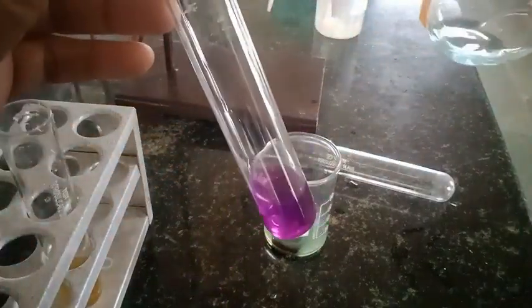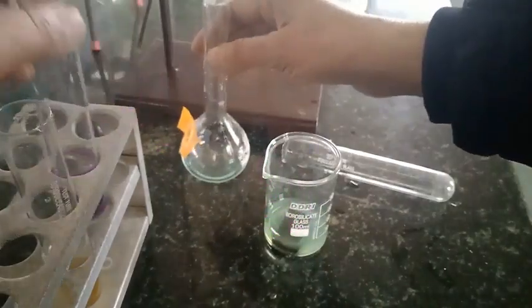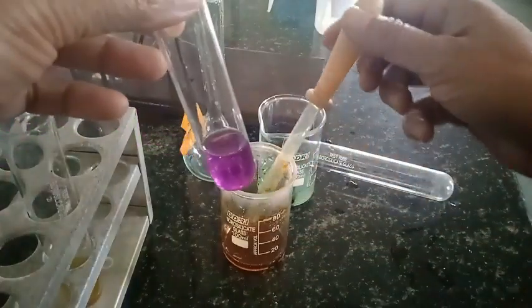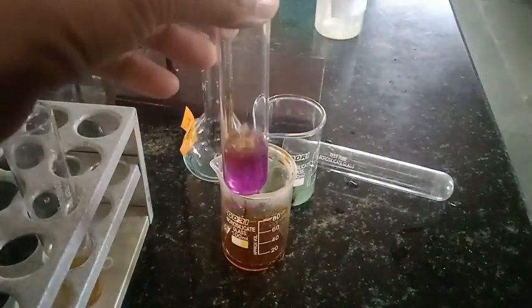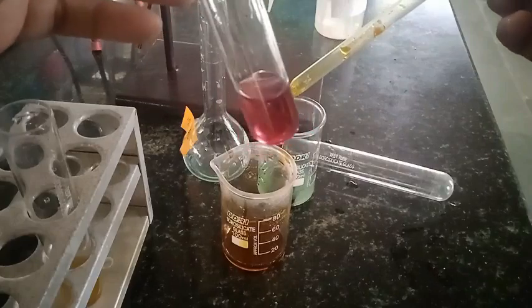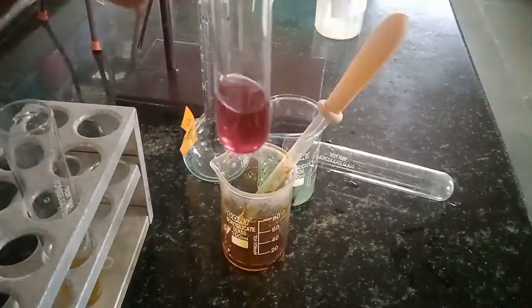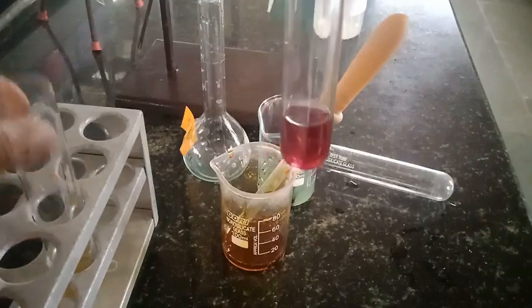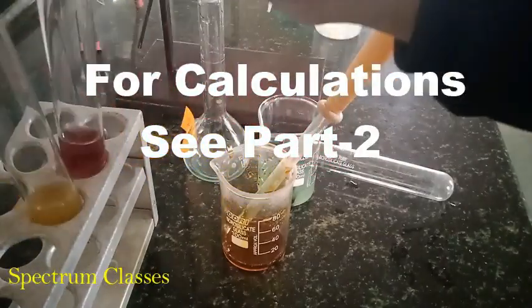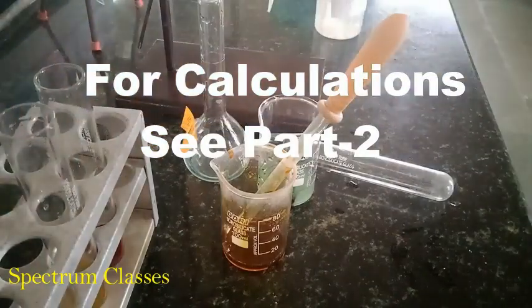I also have an iron 3+ solution. So this is the iron 3 solution, and I am going to add this iron 3 solution to this, and you can see the color. Now we are going to compare iron 2 and iron 3. So this confirms the formation of iron 2+ ions.